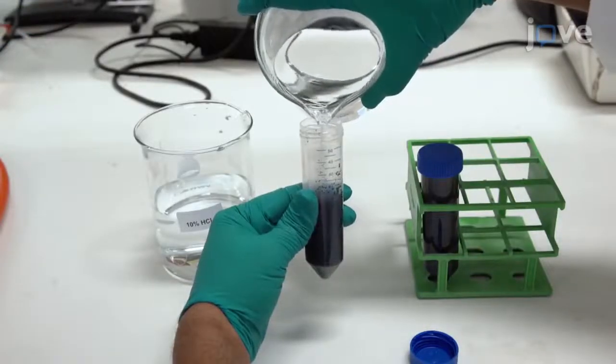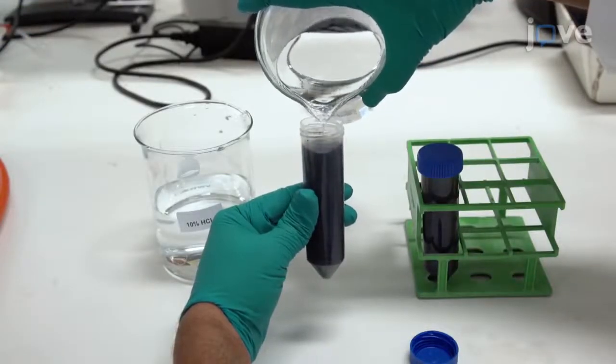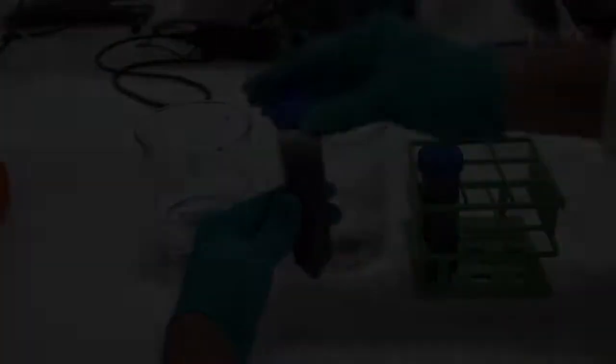After discarding the supernatant, wash the pellet 4 times with warm double distilled water and 2 times with 10% hydrochloric acid.